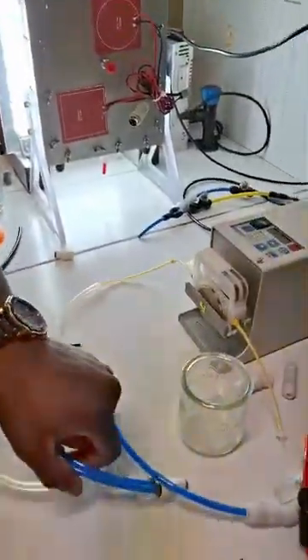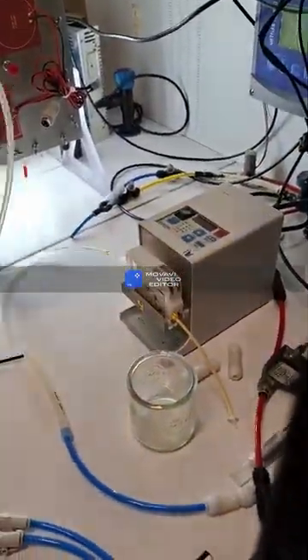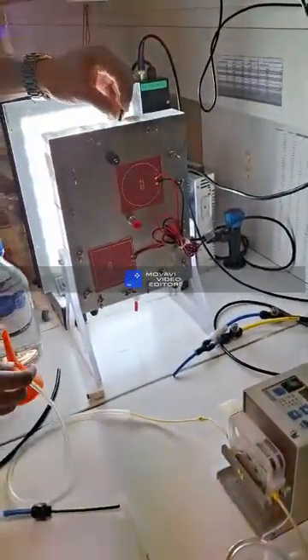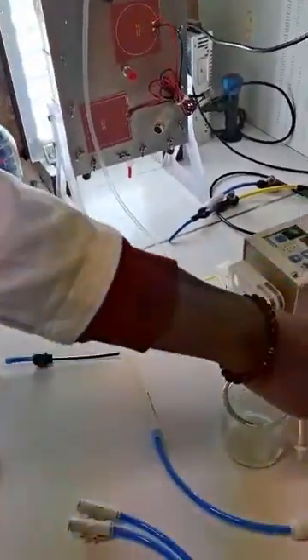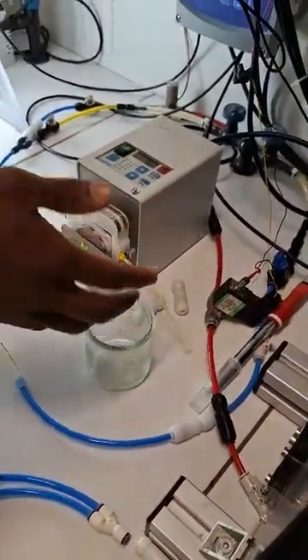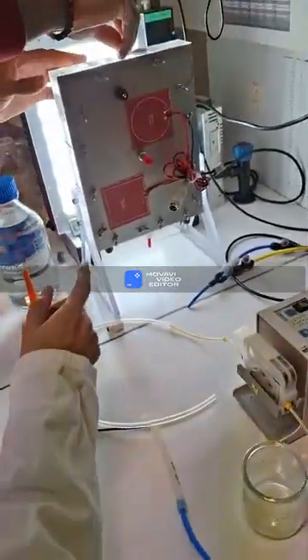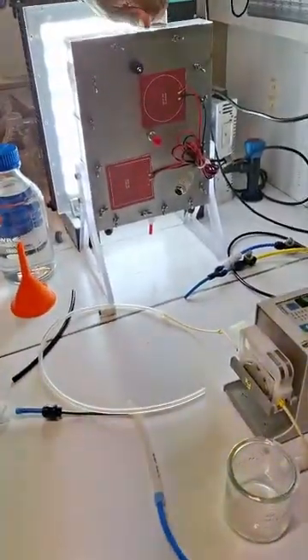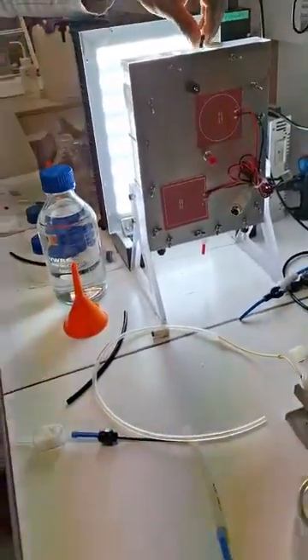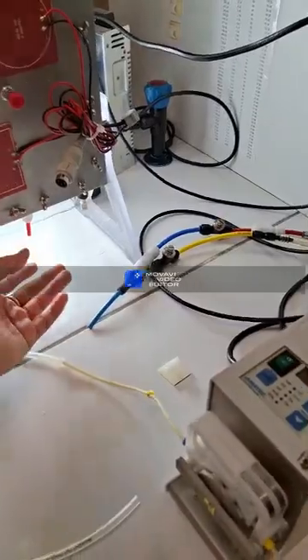Here you have a peristaltic pump. We will plug this and after plug the pipe on it. And on this side, you will have the bottle with the culture medium. Exactly. And could you tell me for what purpose we are putting those things here? Don't worry. Does anybody have an answer for this? We will answer. What is the purpose of these tubes? Like one maybe for inlet?